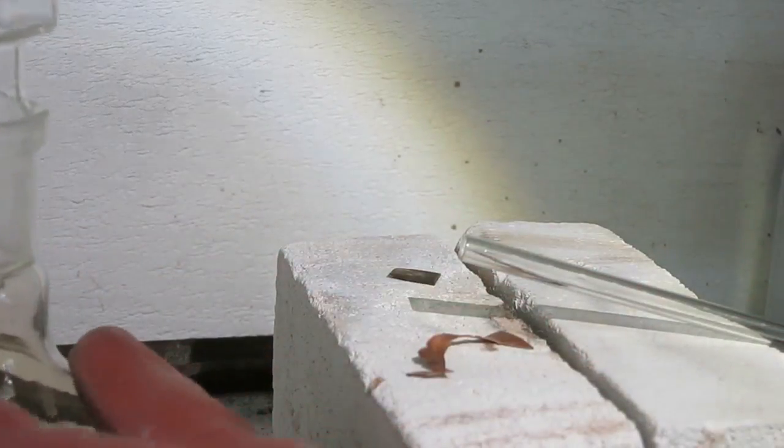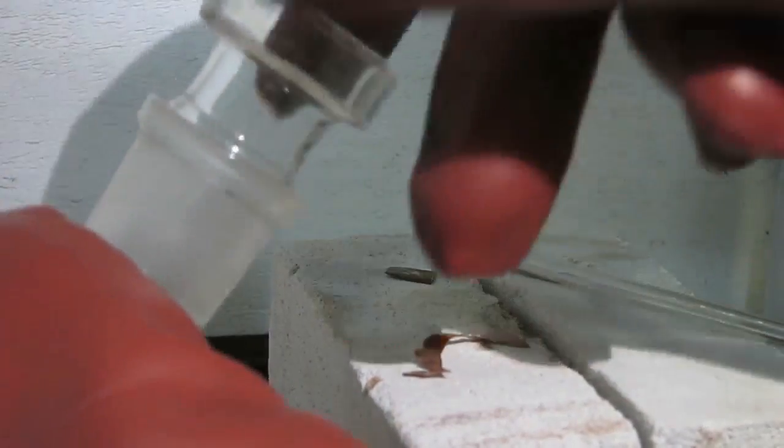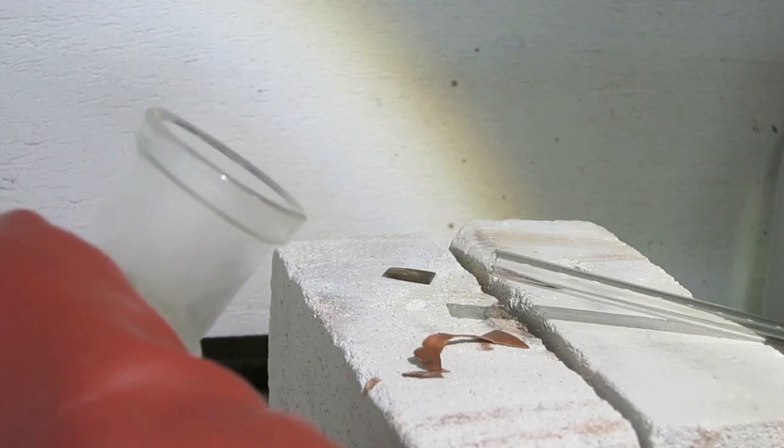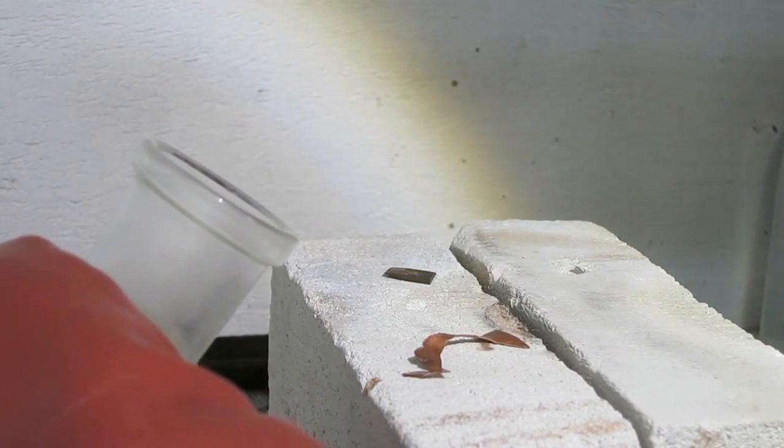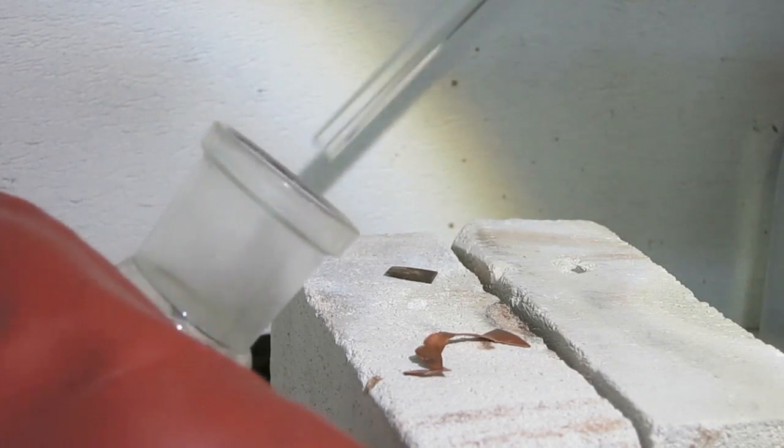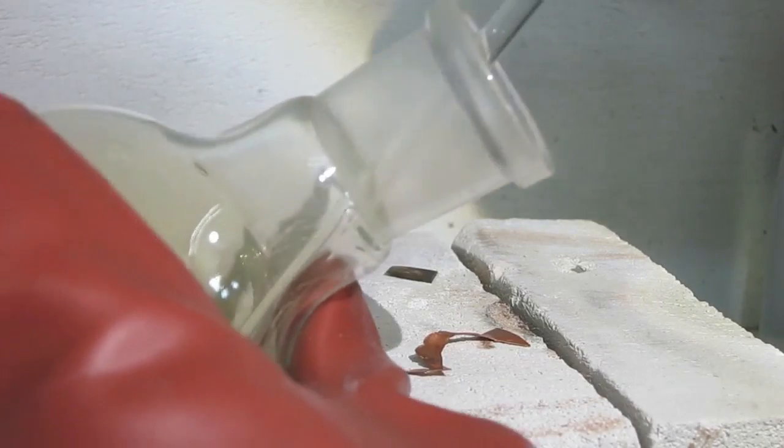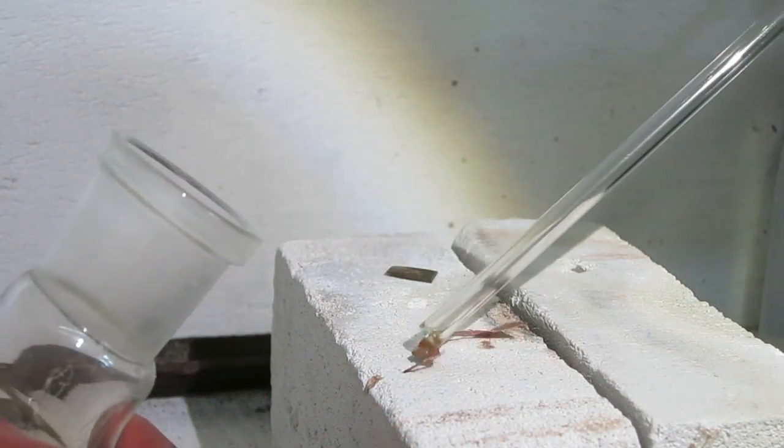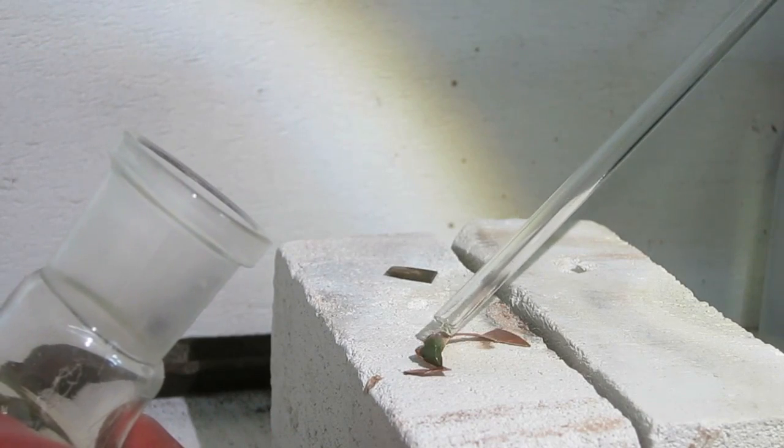Now I'm going to check whether this is really nitric acid. I put a small drop. You see it already. The brownish fumes that's indeed NO2. I put a glass tube into the acid and put a little drop on a piece of copper. You see what happens.